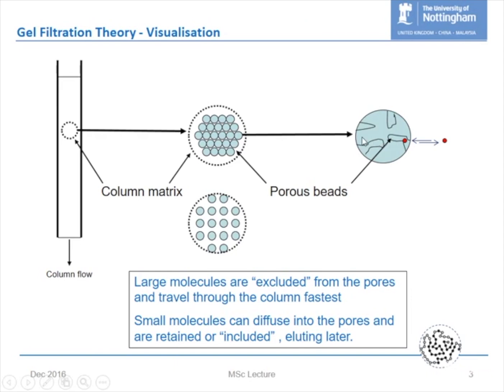And that's really what we want to talk about now. We're going to talk about this KD value, the partition coefficient. In the next couple of slides we'll develop the column parameters in volume terms, but we're actually going to develop something called a KAV, or K average, and this will be an average partition coefficient, and I'll talk a little bit more about that in a second.